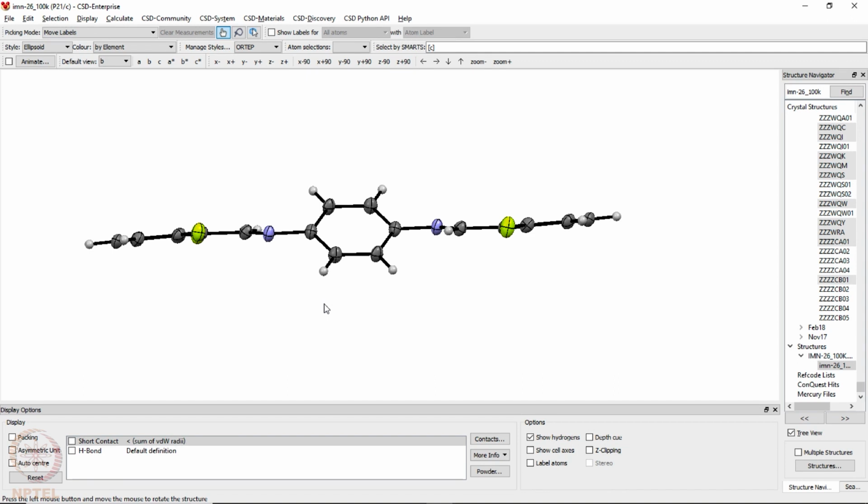So from a given bulk sample of a particular crystal structure, on dissolving and recrystallizing, it may give you a completely different 3-dimensional packing. This new packing may or may not contain a solvent, and that structure is what we have determined using the single crystal X-ray diffraction method.